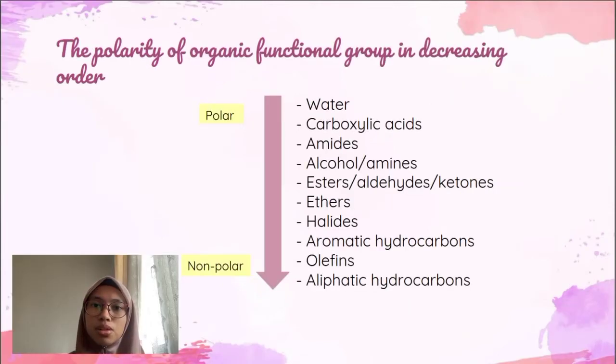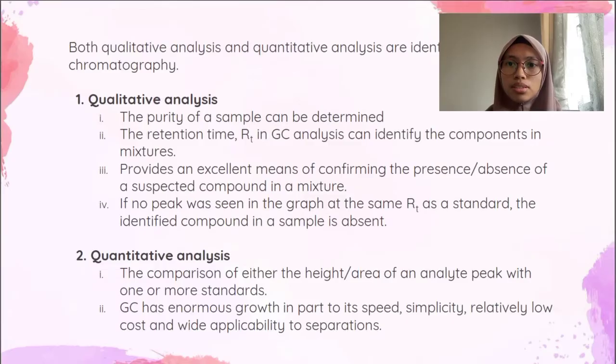Then this is the polarity of organic functional groups in decreasing order. The most polar organic compound is water. The most non-polar organic compound is aliphatic hydrocarbons. Both qualitative analysis and quantitative analysis can be performed by gas chromatography.